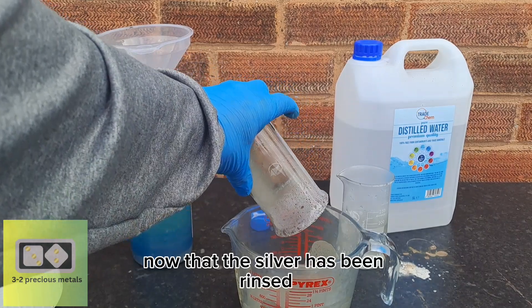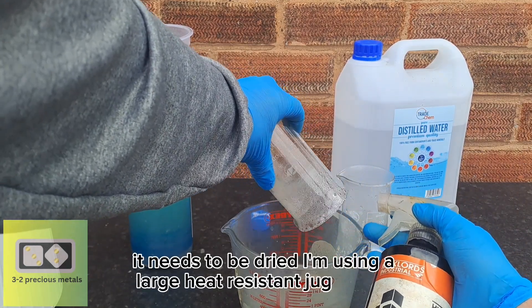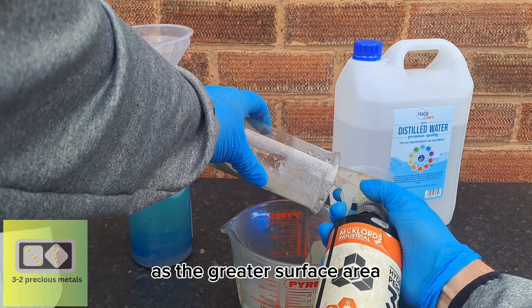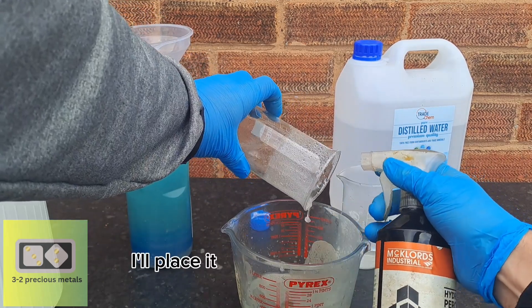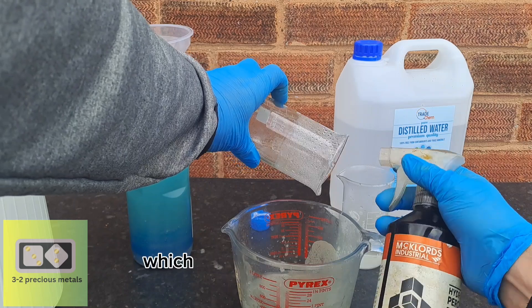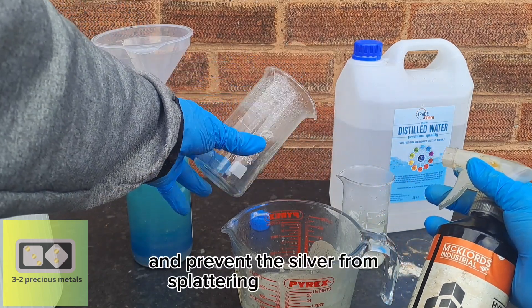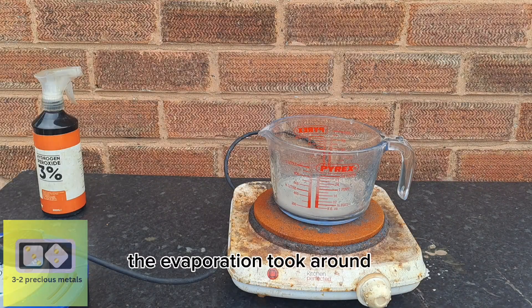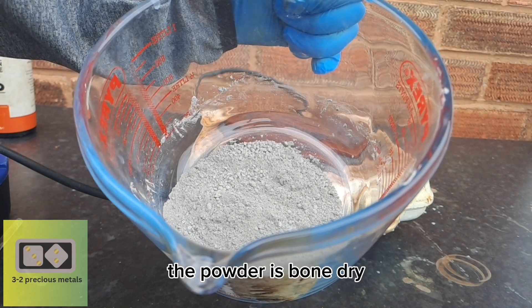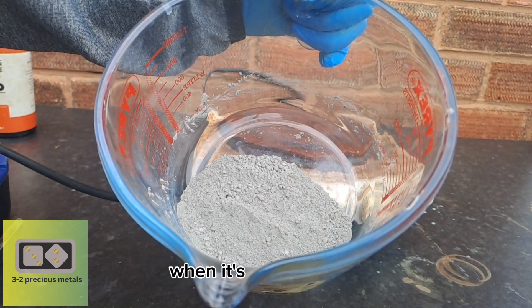Now that the silver has been rinsed, it needs to be dried. I'm using a large heat-resistant jug, as the greater surface area helps with evaporating the water from the silver. I'll place it on my hot plate on a low setting to allow the water to evaporate slowly and prevent the silver from splattering. The evaporation took around 20 minutes, but as you can see, the powder is bone dry. The silver needs to be dry to prevent a steam explosion when it's being melted.